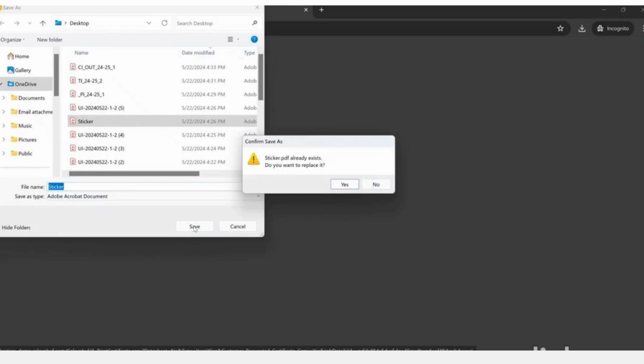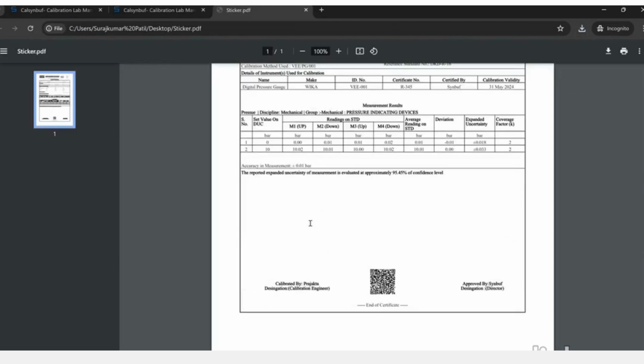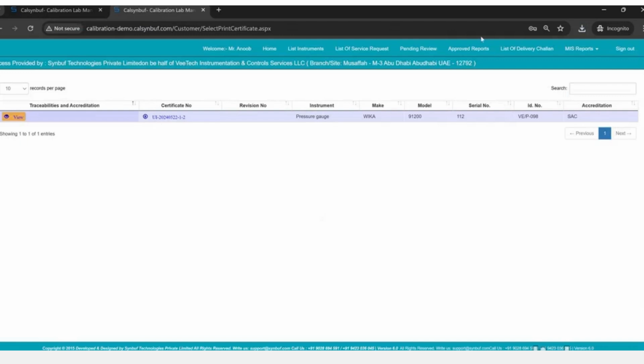And they can download if digitally signed is there. Or else, if you need to allow them, how to implement that is again part of implementation, right? Whether we want to allow him or not, etc.